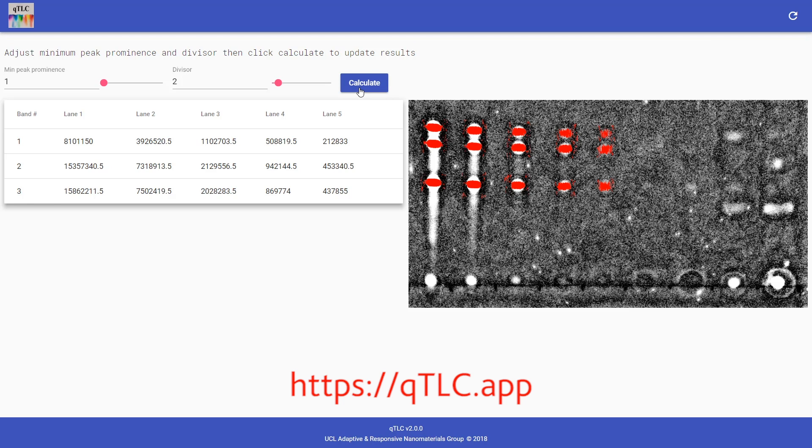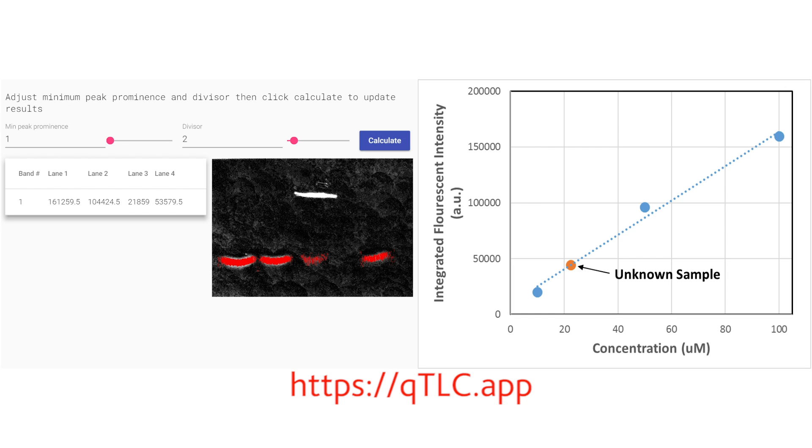You can then plot the data using any data analysis software to obtain the concentration of your analyte.